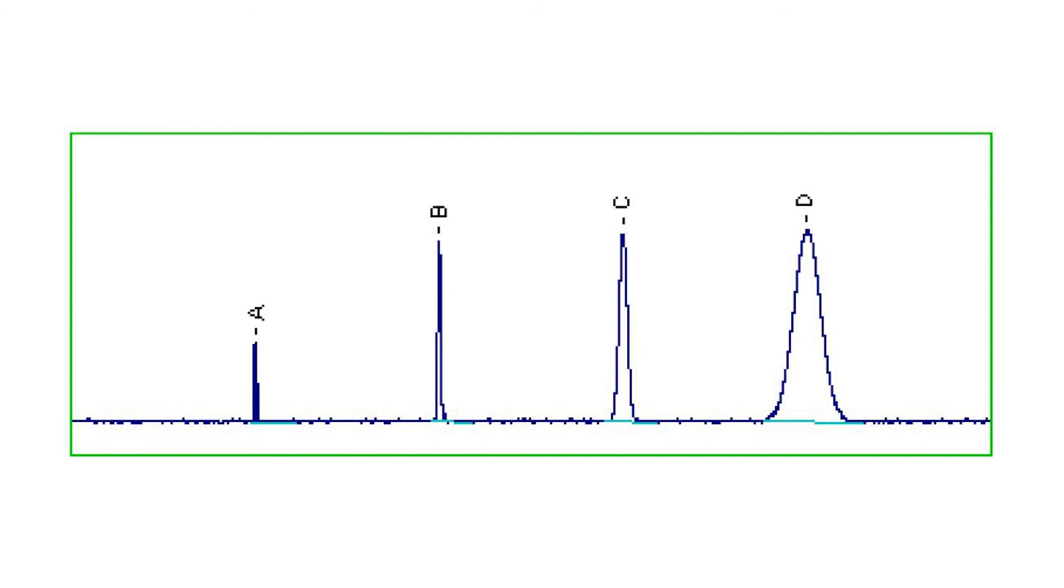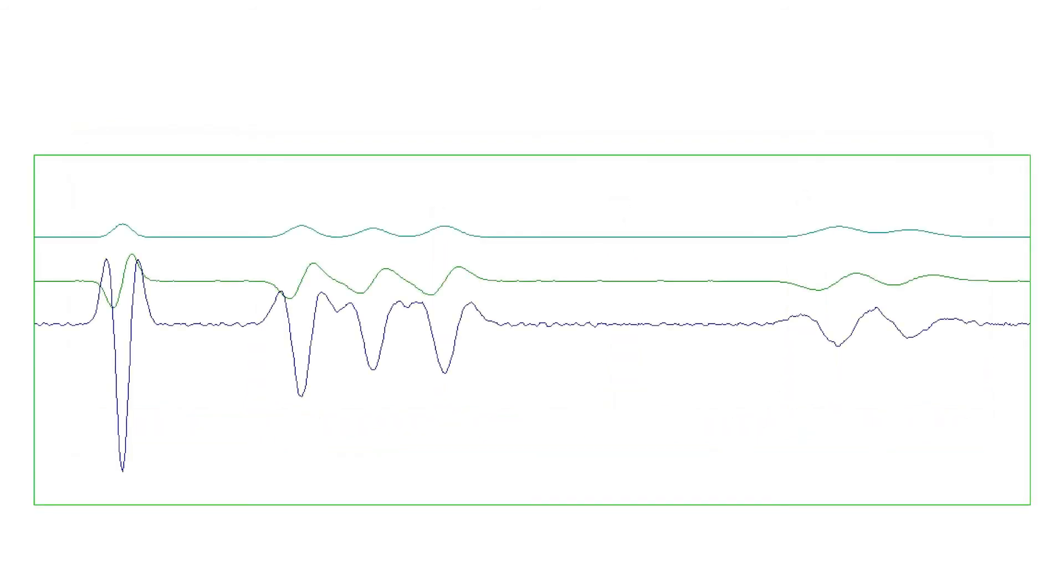The Savitsky-Golay algorithm is unusual in that it preserves not only peak areas, but also peak widths. It is particularly good at reducing high-frequency noise, but less effective with low-frequency pump noise.